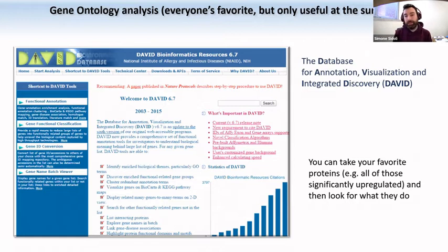And then the other important question is, how do I study the functional enrichment of my proteins in this big table? What do I do? Do I take the top 100 proteins in the top of my table? Do I take my entire list? Do I take the proteins that are significantly enriched? If you take those that are significantly enriched, you need to choose a hardcore threshold where you filter for a specific p-value, for example.